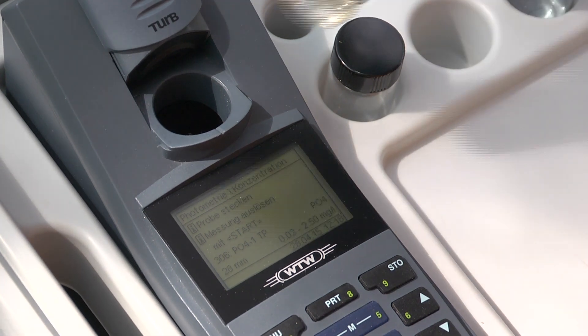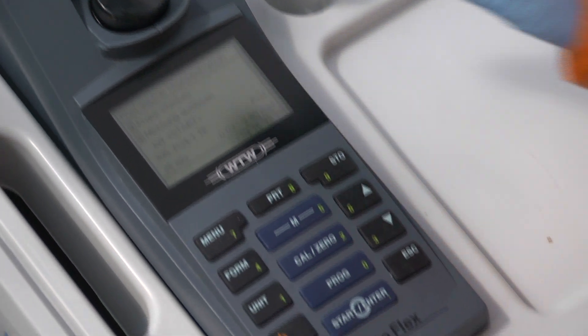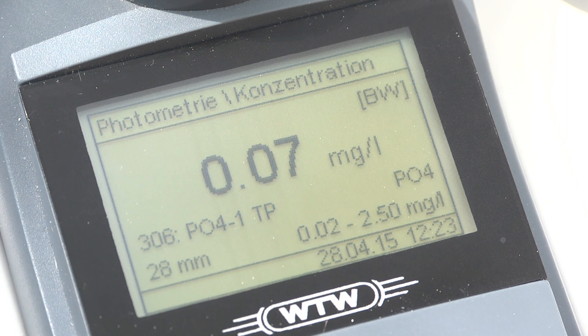Now we put the vial into the meter and using program 306, we start the phosphate reading. We get a result of 0.07 mg phosphate, which is very low and means that the water quality is good.